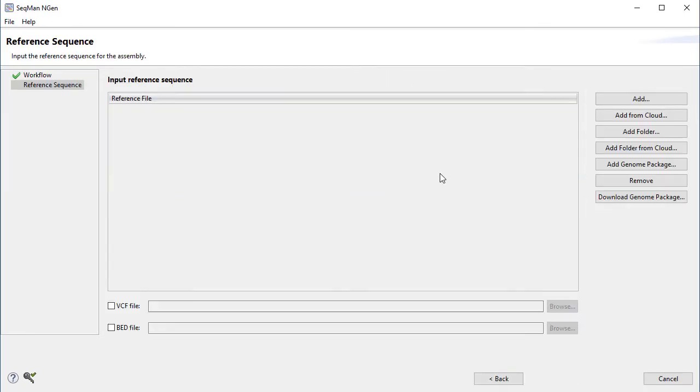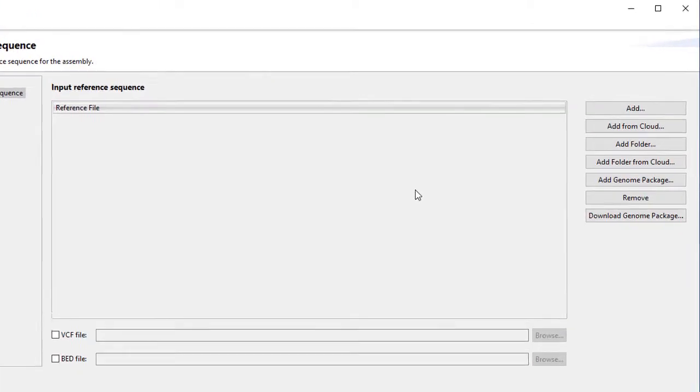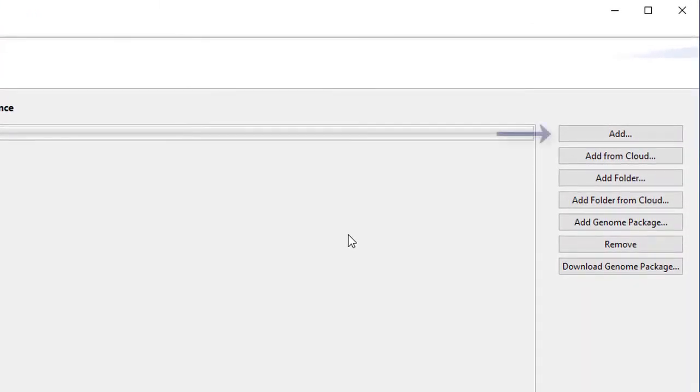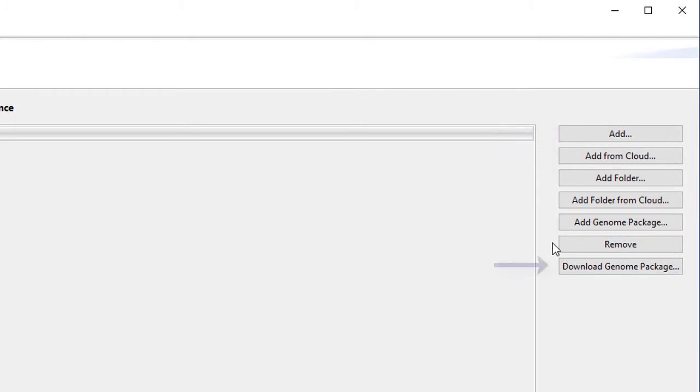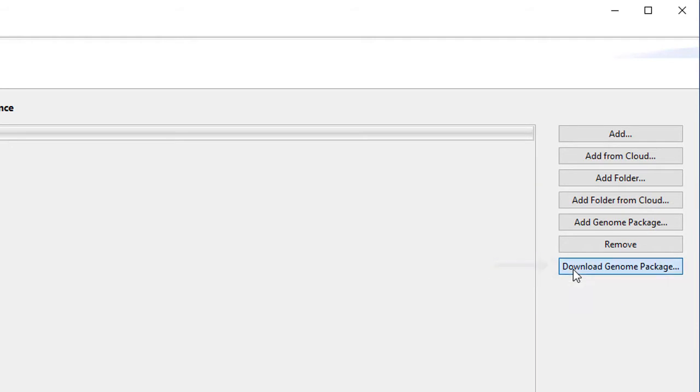Next, input your reference genome. You can add a local file, such as a GenBank or FASTA, add files from the cloud, or download one of our genome template packages.